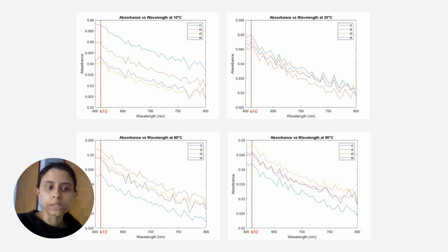It is worth mentioning that in future experiments the wavelength range could be bigger, probably from 100 nanometers to 800 nanometers. This could show the presence of terpenoid and eugenol in the repellent, since they are present in bay leaves and are mostly seen around 200 nanometers.